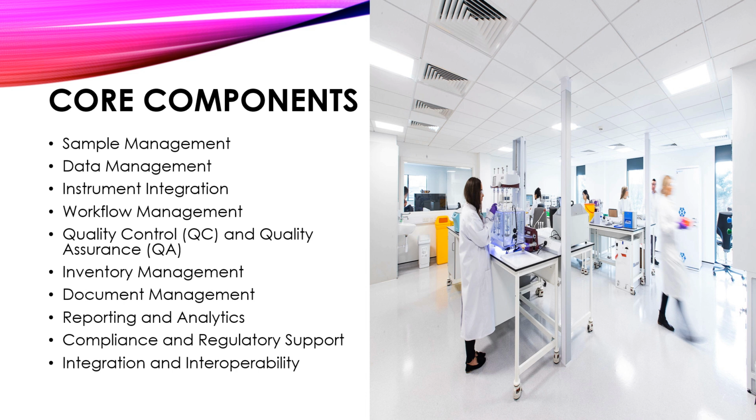Instrument integration. A laboratory management system integrates with laboratory instruments and equipment to automate data capture, analysis, and reporting. This integration reduces manual data entry errors and enhances efficiency by directly transferring data from instruments to the laboratory management system.